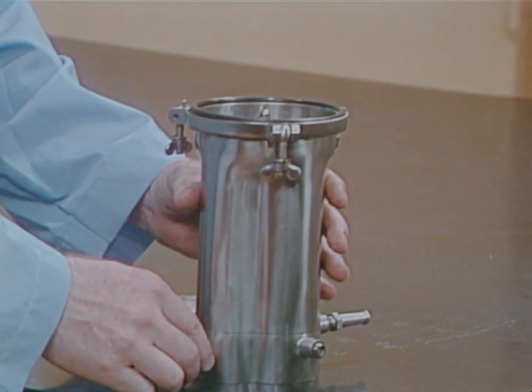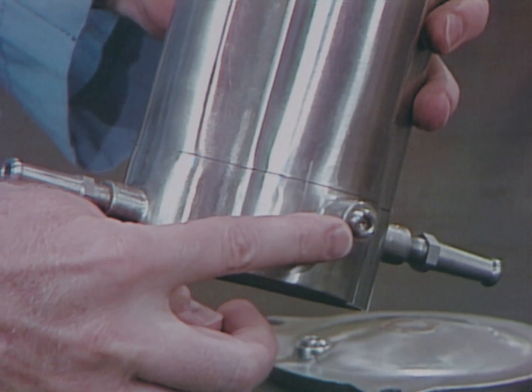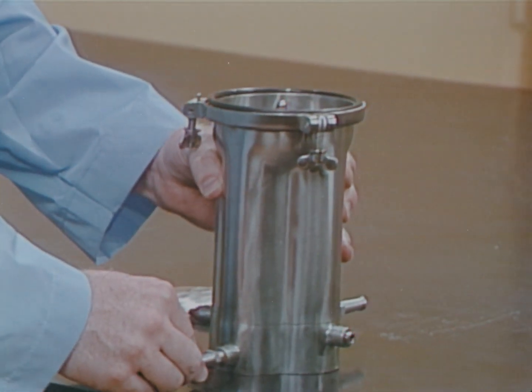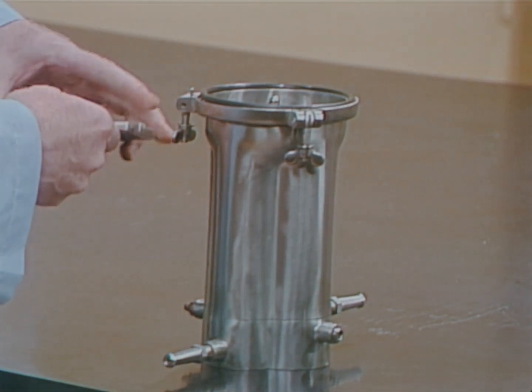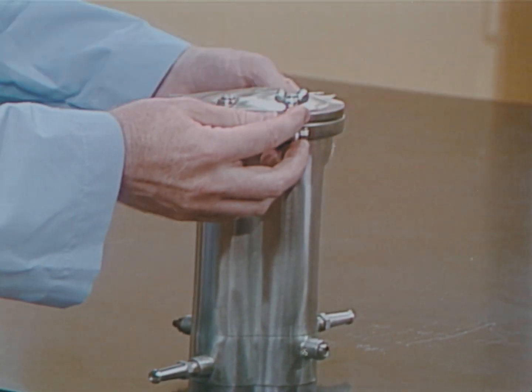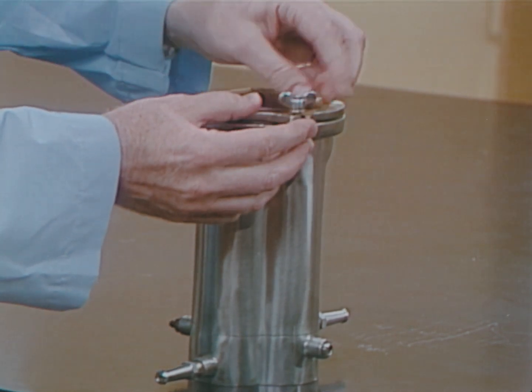The aerosol-free blender is equipped with a closed drainage system to drain the contents. When you bypass this closed system and immediately remove the cover, an aerosol is released. Remember, violent agitation generated by the cutting blades causes aerosols, which remain suspended within the blender for over an hour after it has stopped.